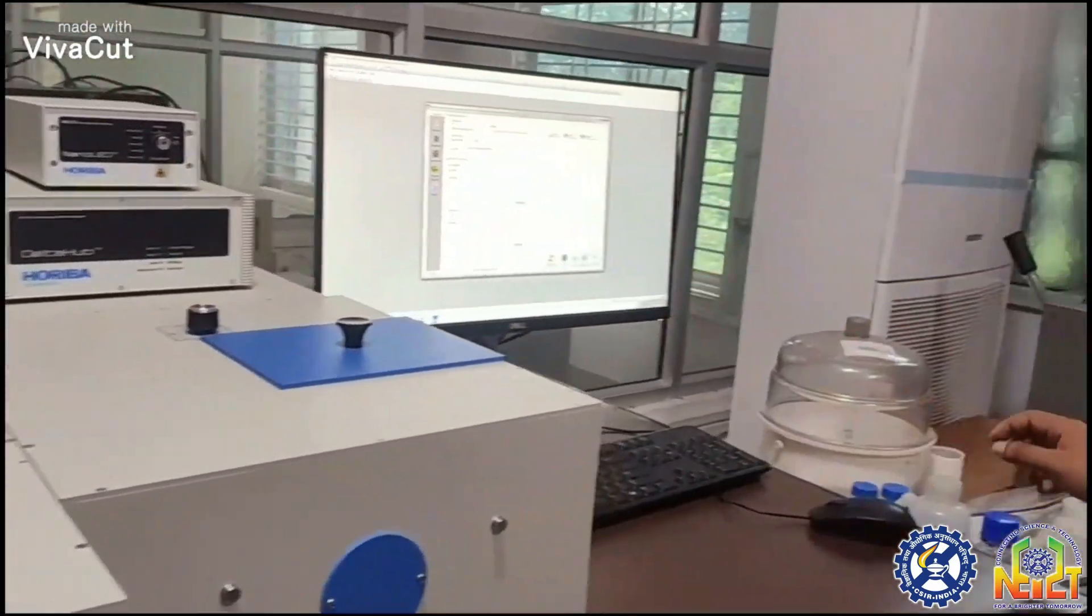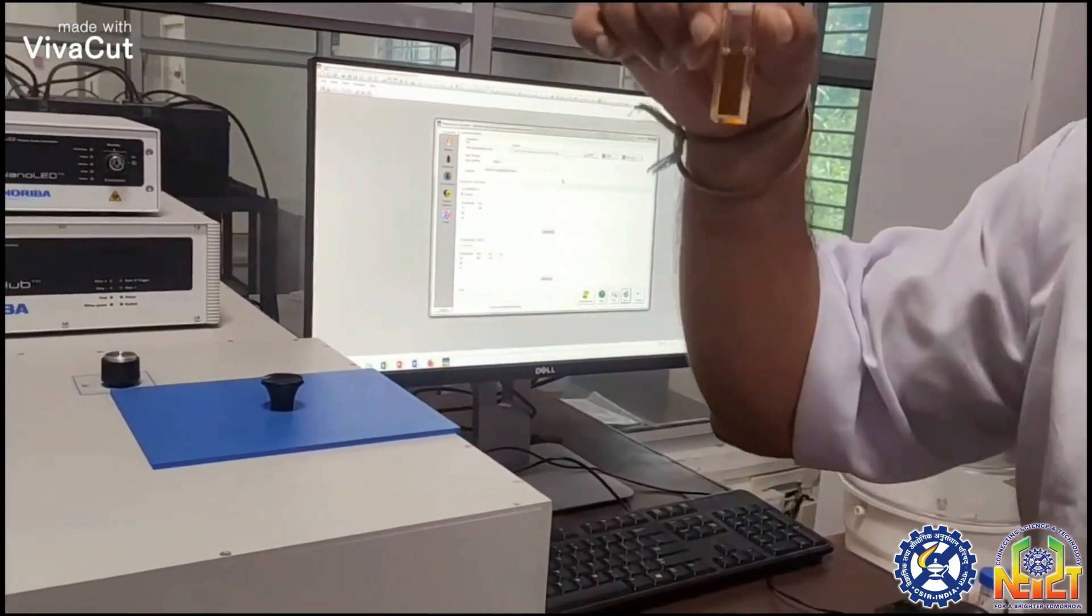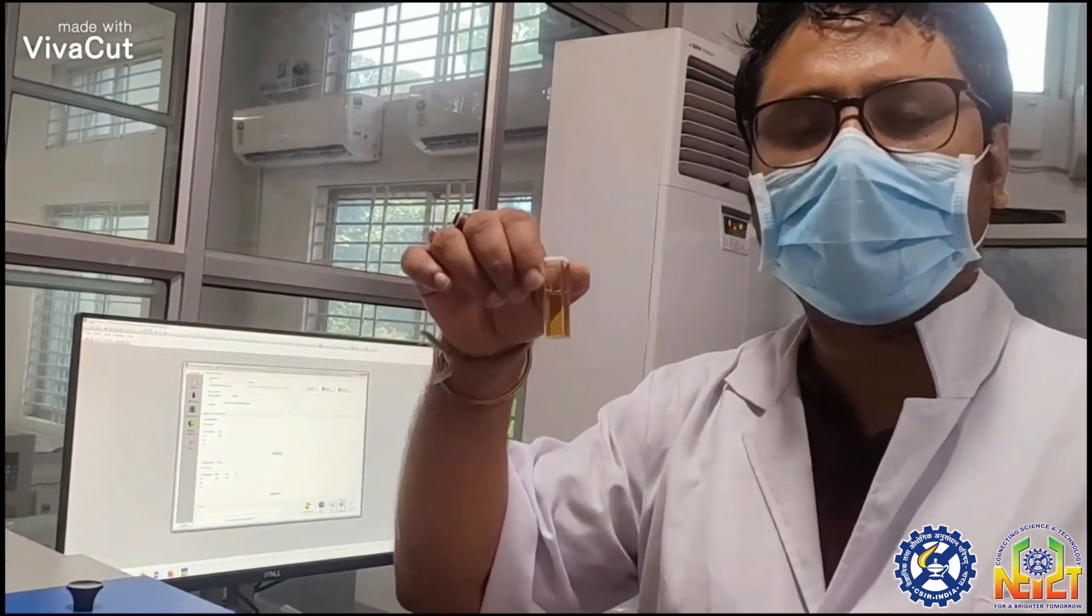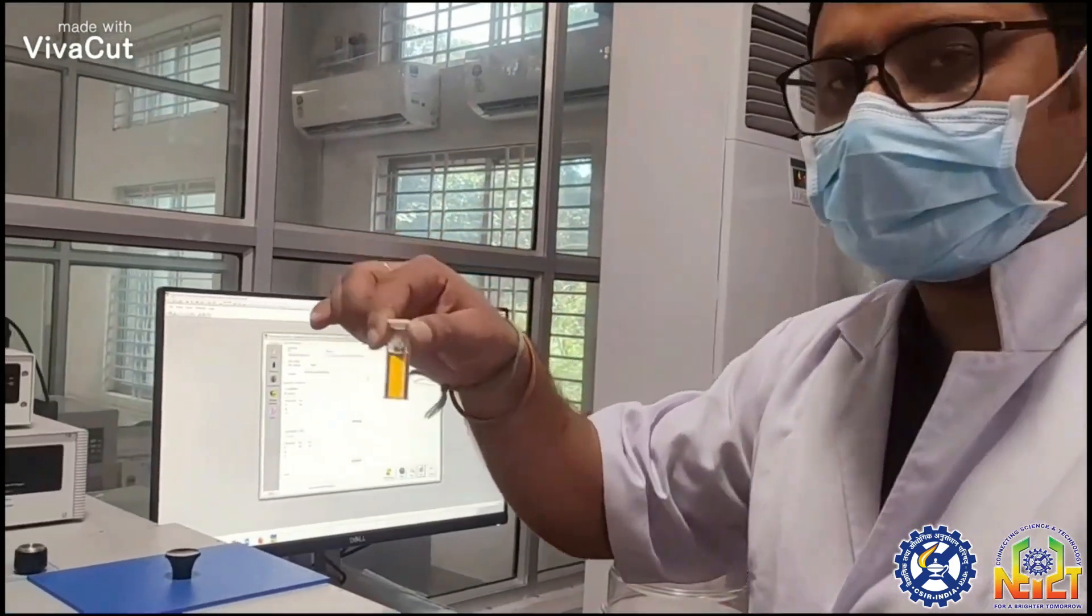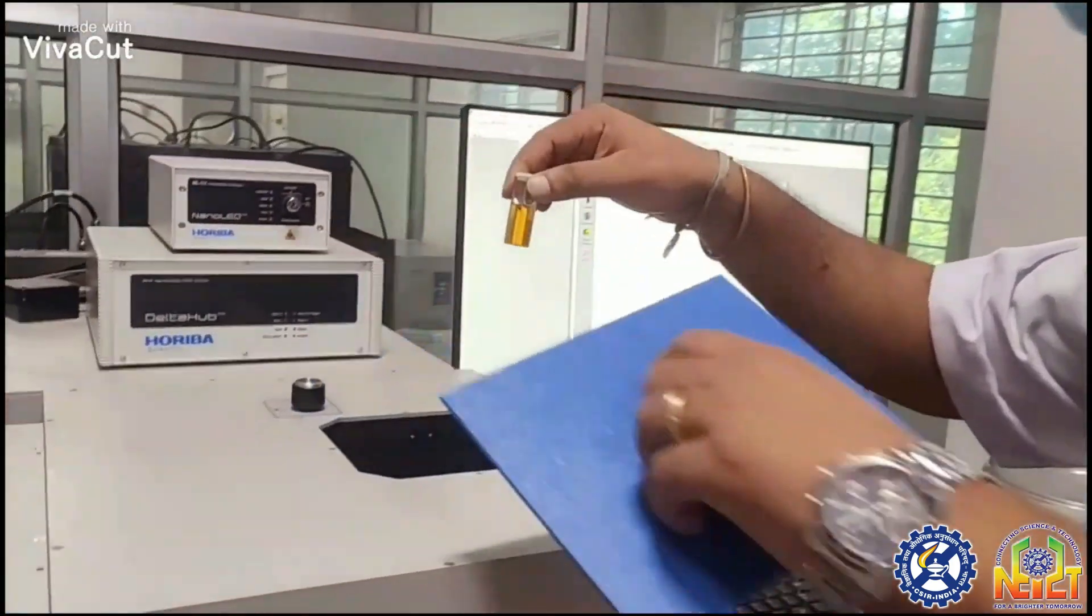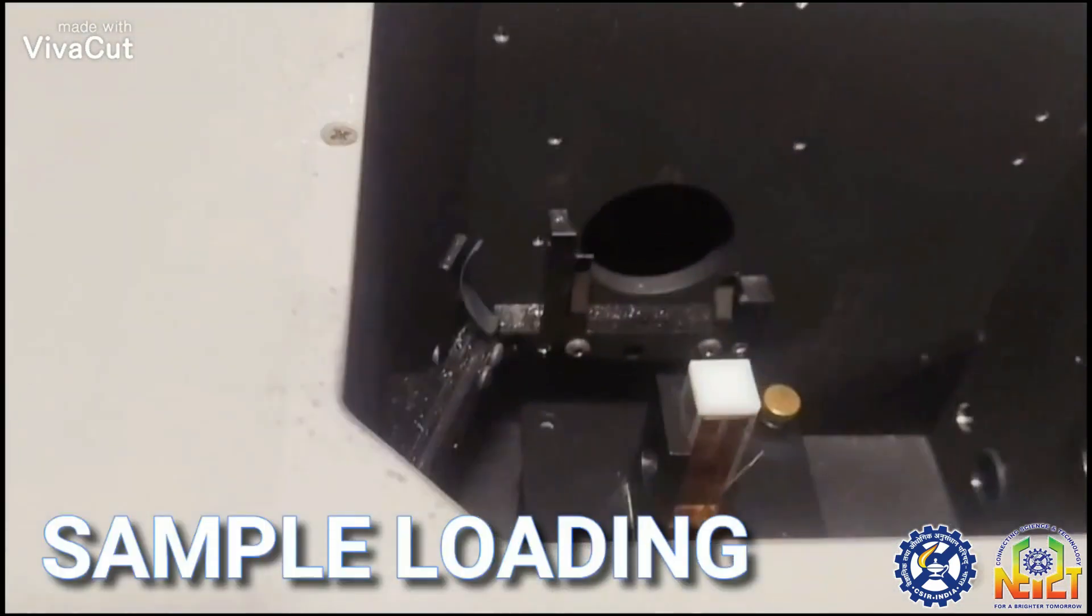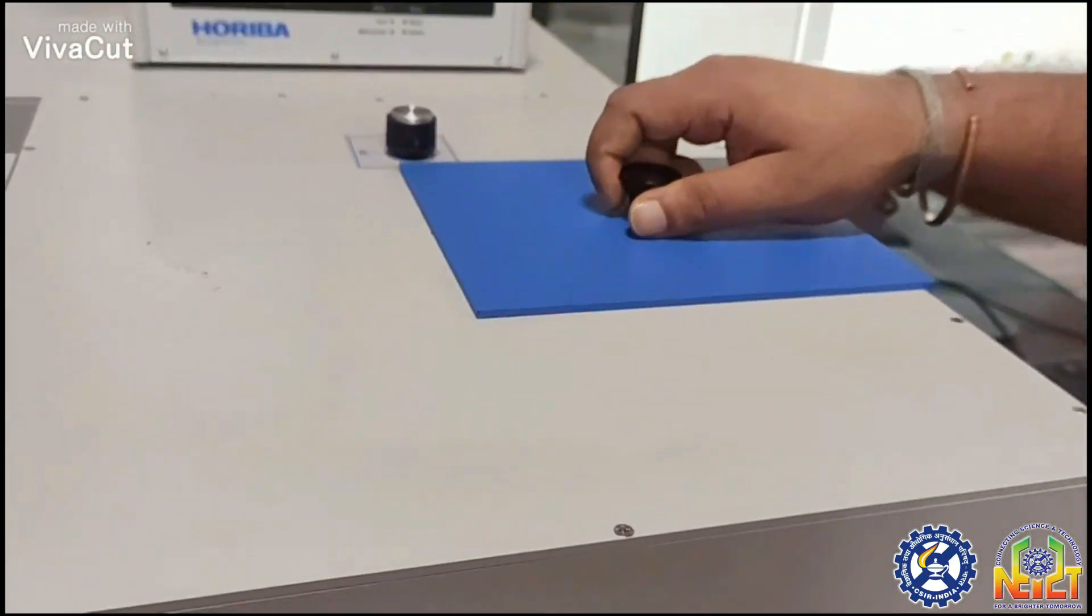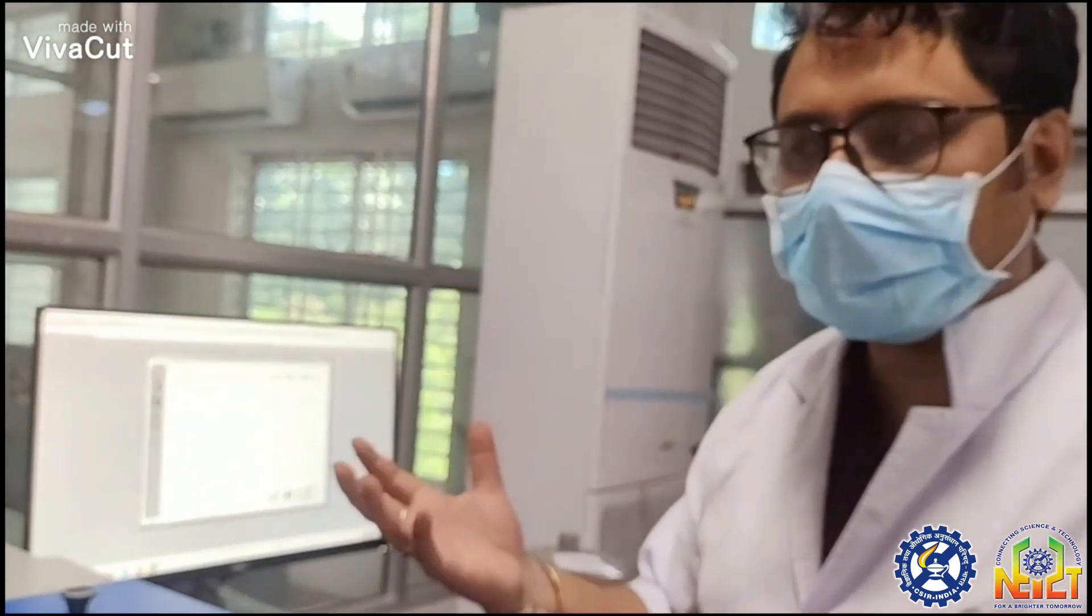For this experiment, we have prepared carbon dot material with a particle size around 4 nanometers. We place this material in a cuvette holder. We know that carbon dots get excited by UV light.